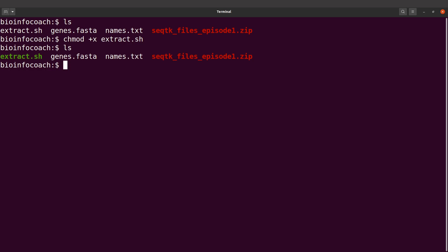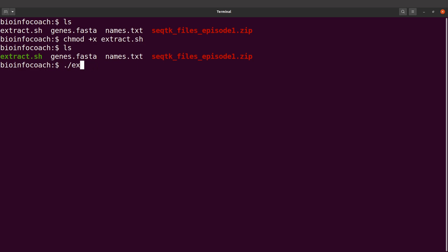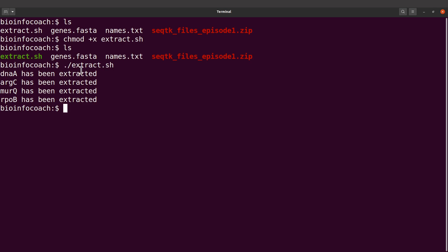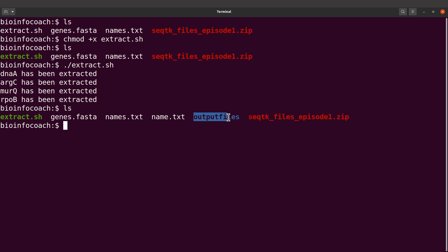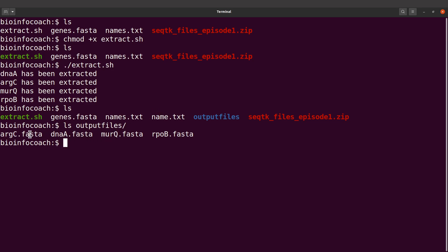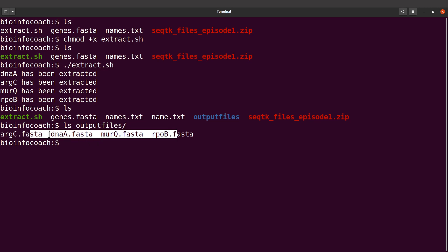Now that we have this, what you need to do is execute the script. You can say dot slash extract.sh, or you can also say bash extract.sh — either approach should be fine. For me, I'll say ./extract.sh and execute the command. Perfect — the sequences have been extracted. Let's do an ls; we find the directory output_files with the sequences. If we say ls output_files, we get four files — one for each of the sequences.